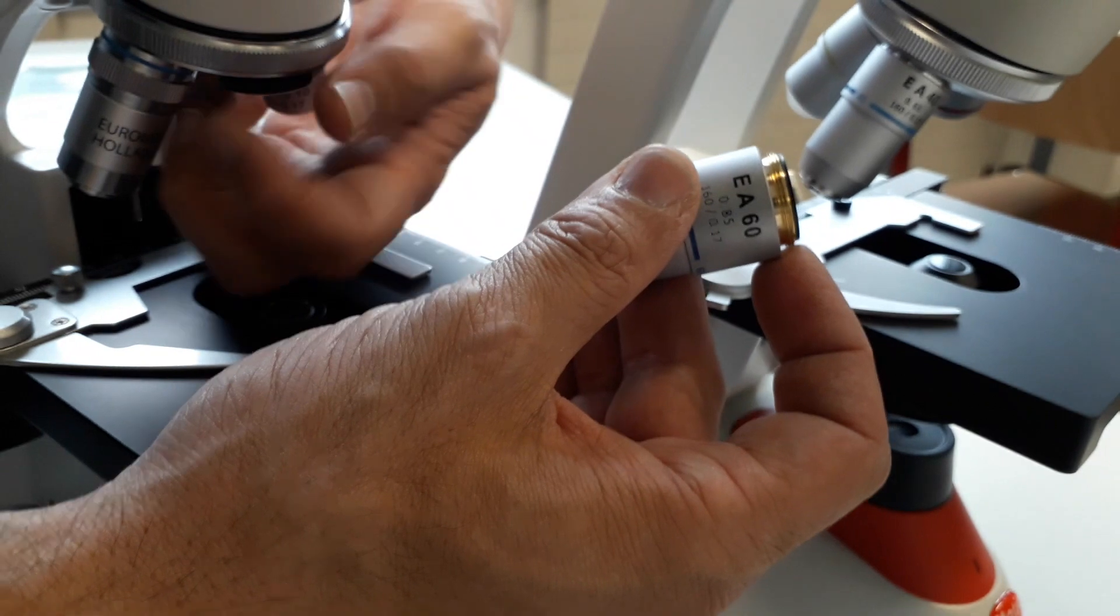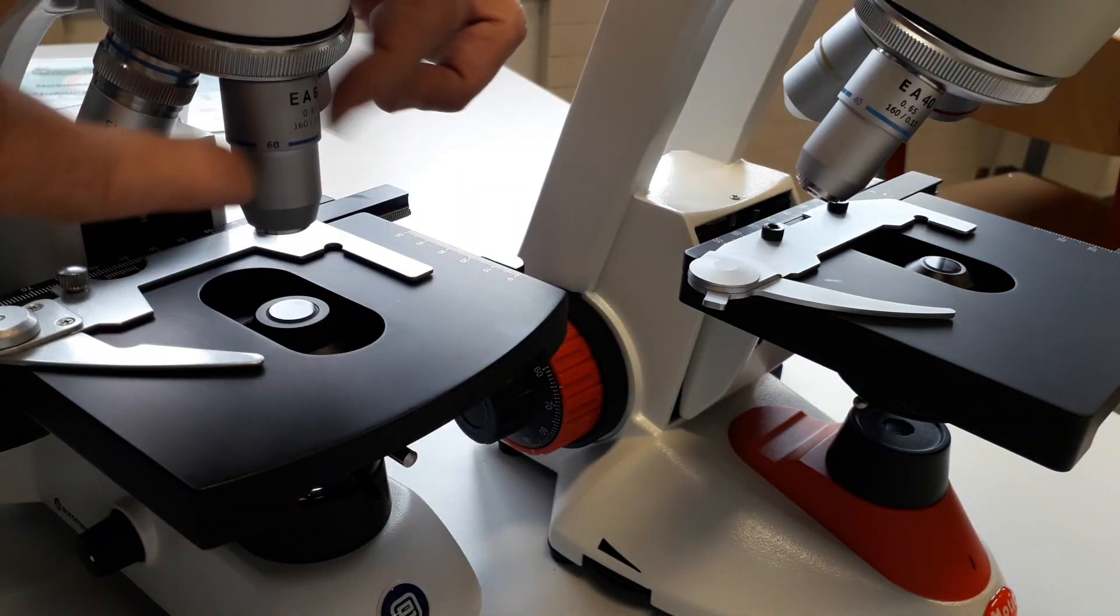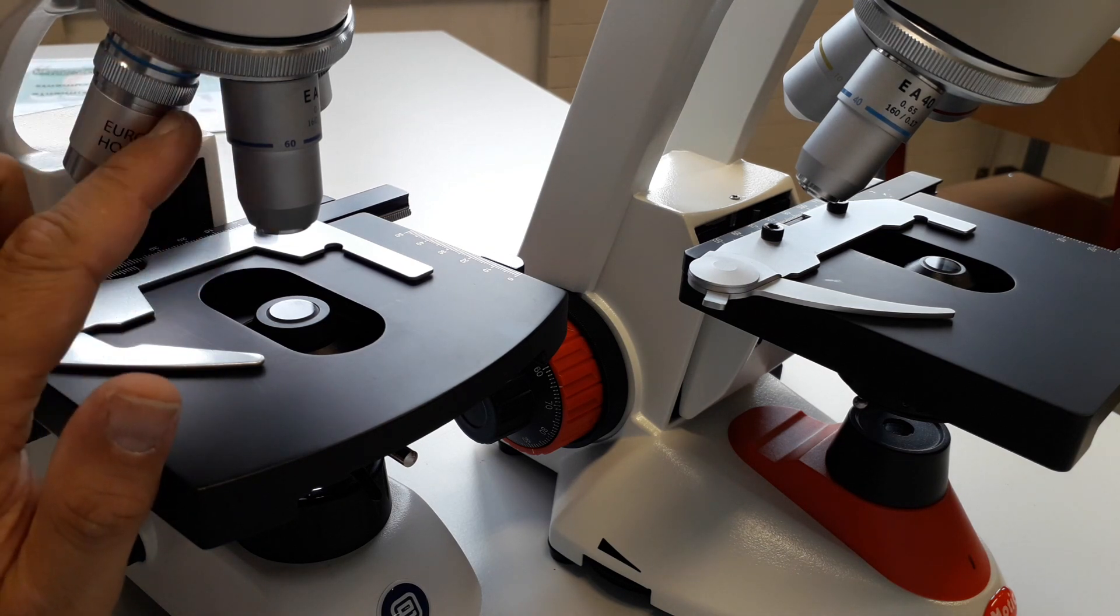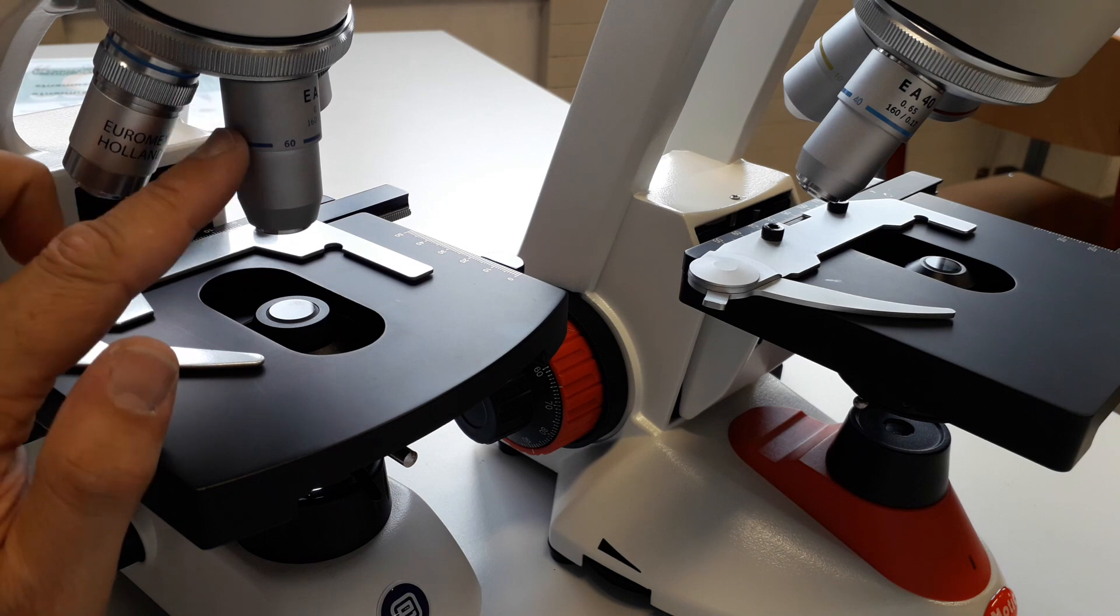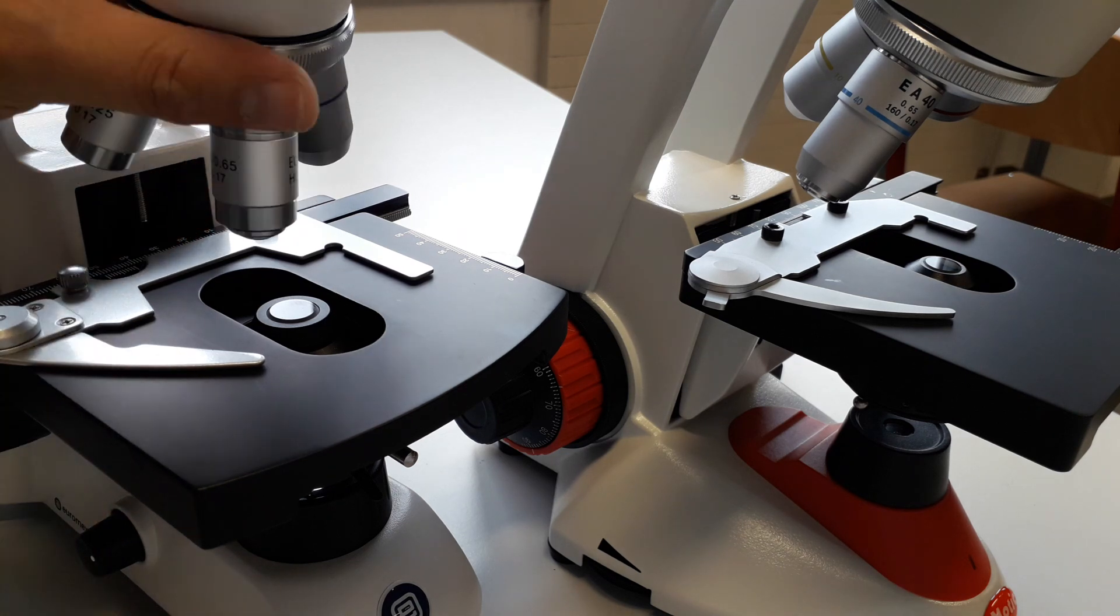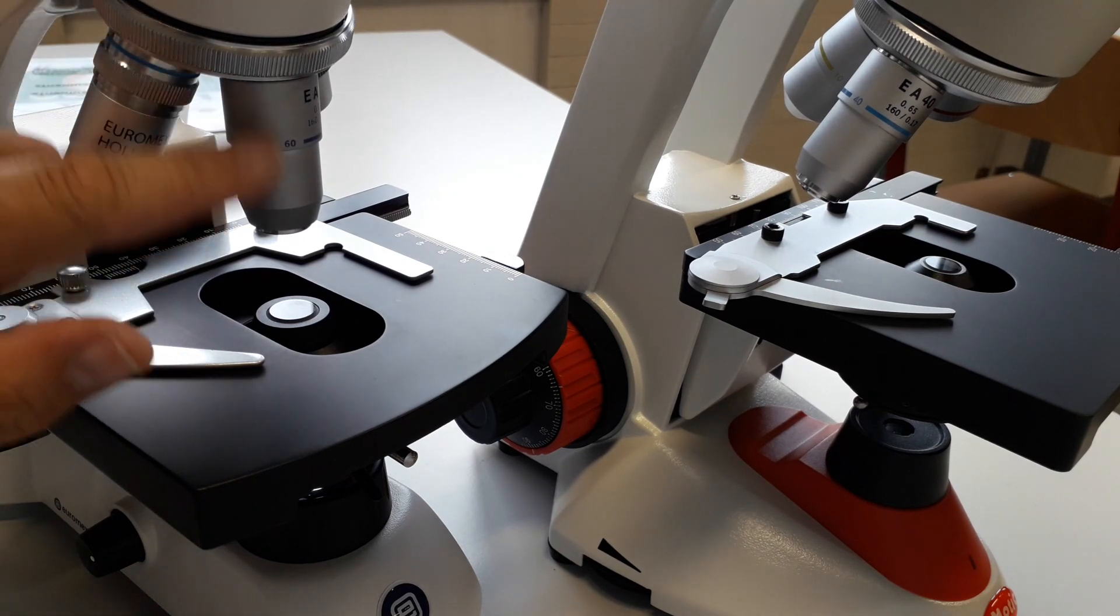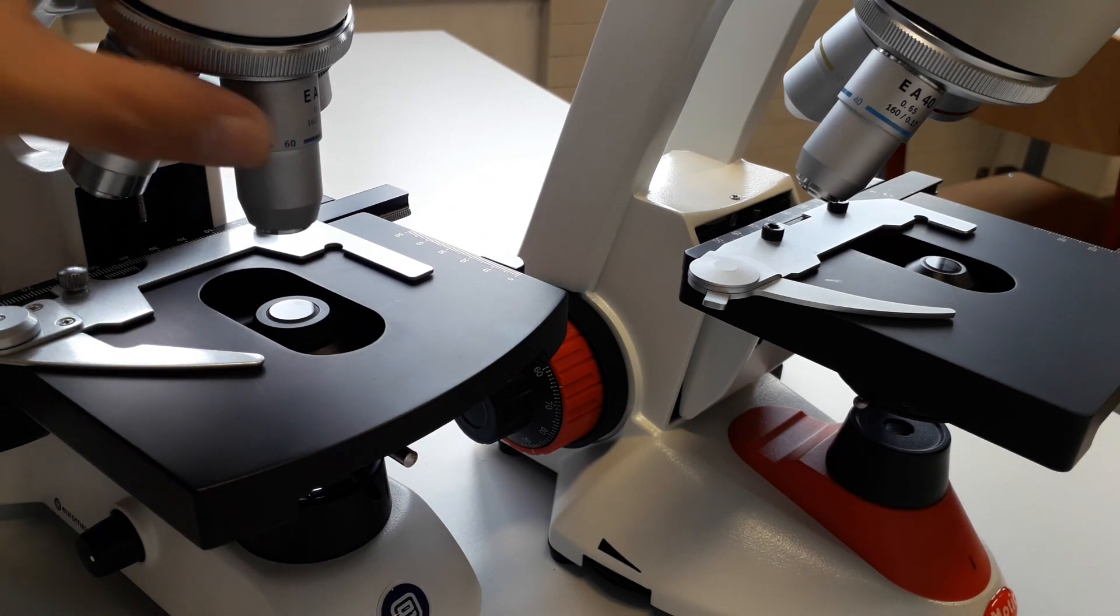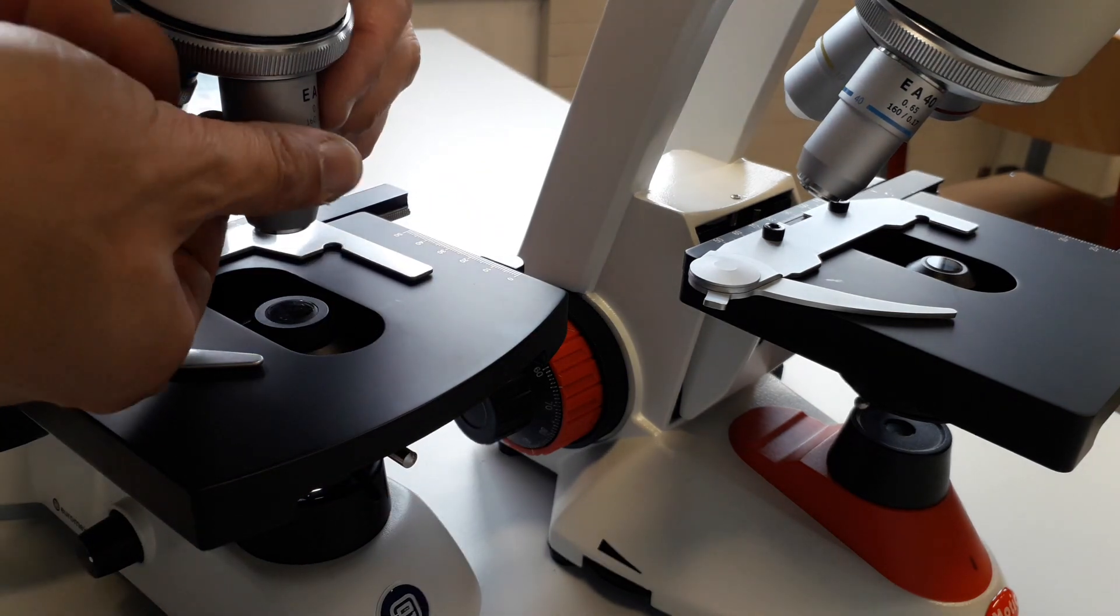Well, both of these microscopes belong to this 160 millimeter standard, a very common standard. And just to show you what this means is, I mean, I just connected this 60x objective over here to this microscope. But theoretically, I could actually also connect it to this one over here. And it's going to fit. I'm just going to show you that actually it does fit. Because the threading here is standardized. It's the RMS threading, they call it from the Royal Microscopical Society. And it also fits in here. So that is possible. The only thing is, is that now the two objectives here are now of a different brand. So the only problem that there might be when you mix different objectives from different manufacturers is that you lose power focality. So this means you have to, when switching from one objective to the next one, you might have to refocus. But if it's from the same series, you don't need to refocus. So I would not automatically recommend that you mix brands like this. But it is theoretically possible. At home, I have done that. And because I'm a little bit more experienced, I don't mind refocusing. For students, I do not recommend doing this. But this is simply to show you that essentially the systems are interchangeable. I'll now put it back again to where it should be.